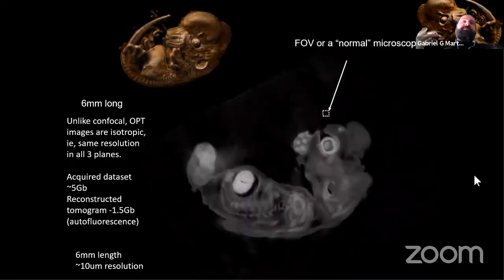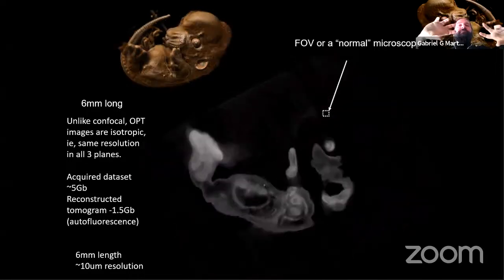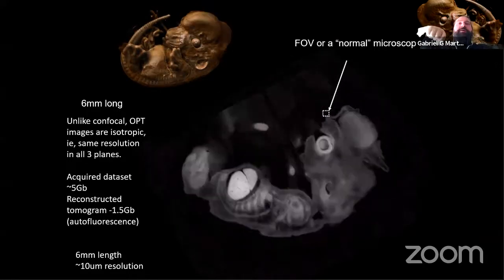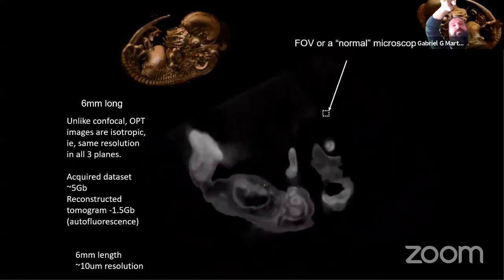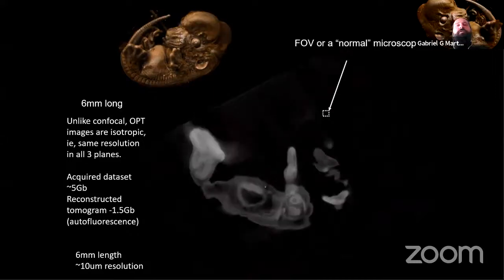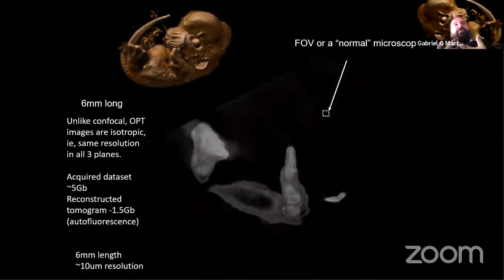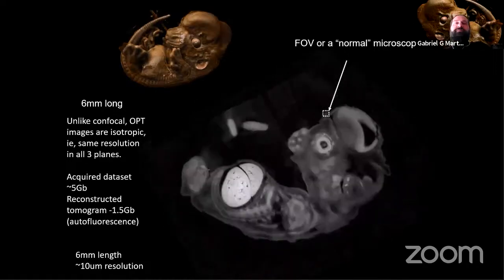And you can acquire images very, very fast. On a light sheet microscope, you still have to flip the sample to image from the other side, because on an OPT, you get images from all the angles. The quality is really symmetric. You always get the same quality from any angle. So you don't have to do multi-view reconstruction. The reconstruction itself is a multi-view reconstruction process.